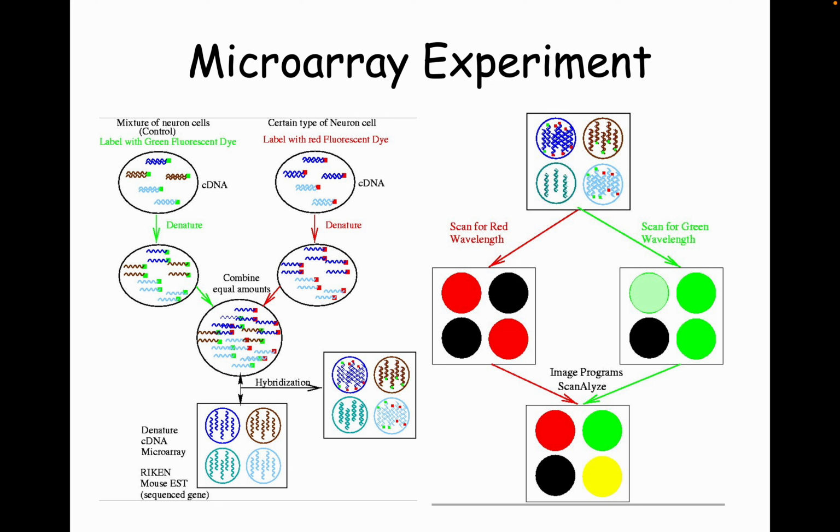So examples of microarrays that I have done. If you have an antibody and you know the antibody binds to a protein, but you don't know which part of the protein it binds, that's easy. You can take the target protein, the one the antibody binds, and break it down into little tiny regions. Let's say, 15 amino acids at a time. And you can do 1 through 15, and 2 through 16, and 3 through 17.